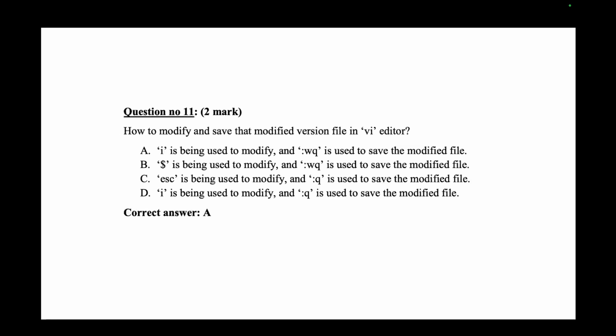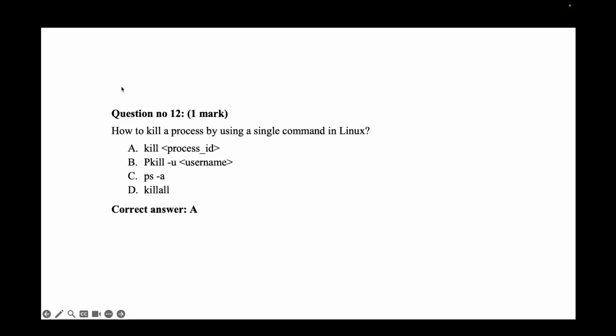It's actually quite straightforward. It's kill, space, the ID of the process. But this is only required when you are running it in some sort of queue, where there's an ID associated with your process. So you have submitted a job somewhere for a command, and that has been given to you as an ID, that job ID. Then you can use kill space the job ID to kill that process.